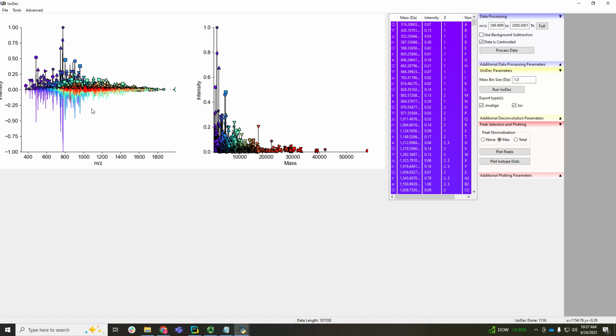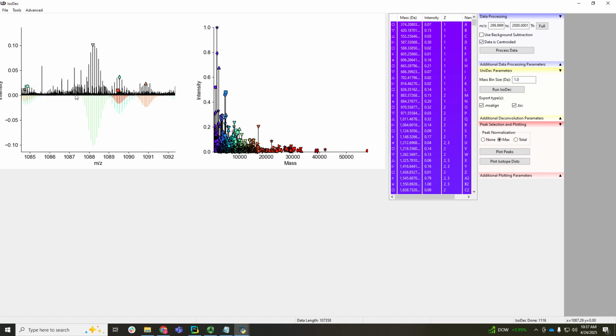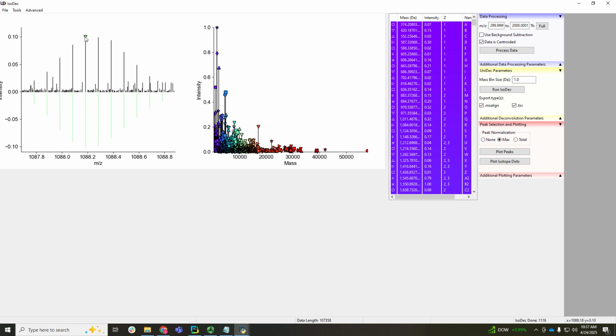below them. So now we can zoom in and get a better idea of what's going on in that scoring and shifting stage of the algorithm. So here's an example where it looks like this may have been the most abundant peak. These two are pretty close, but basically the max monoisotopic shift corresponds to how many isotope peaks this whole distribution would be shifted relative to this experimental distribution for scoring.